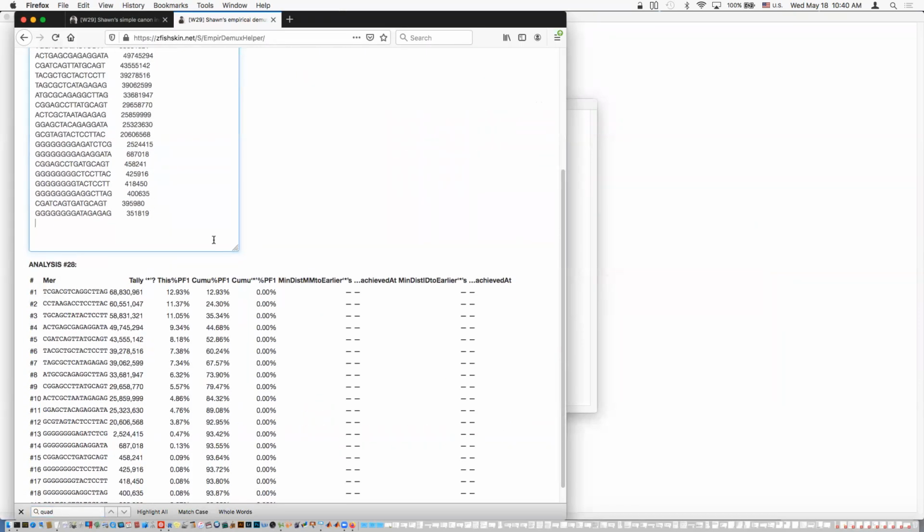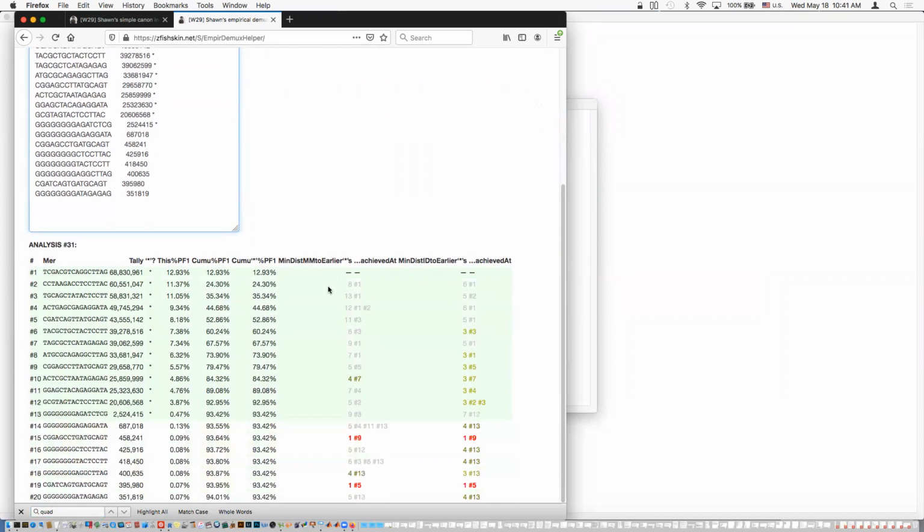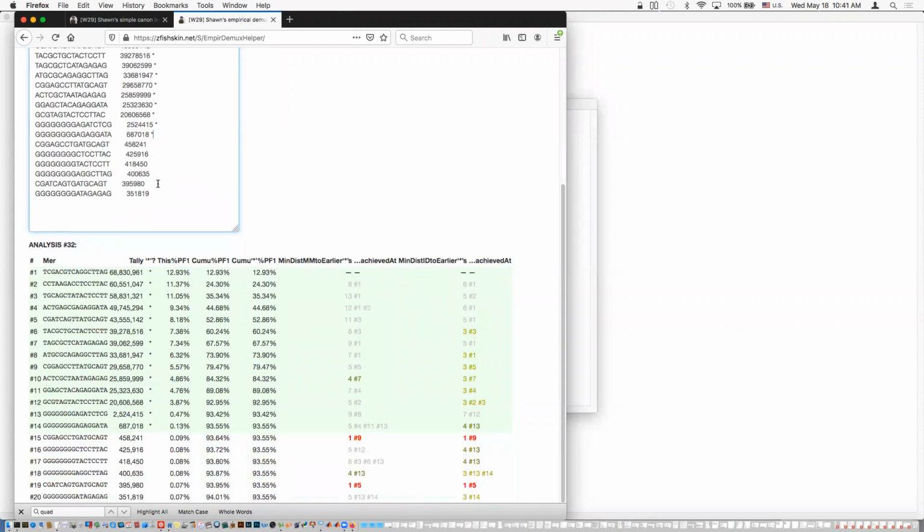Okay, and we might as well mark the really obvious cases that look good. Actually, this next one we probably should keep too because it's high indel, not close. Then that's a one mismatch. Here, of course, the analysis is taking these 16 mers as a whole, which is the way the FASTQ thinks. In R, we're going to do it a different way. In R, we're going to keep the I1 analysis separately from the I2. We'll keep them as paired.